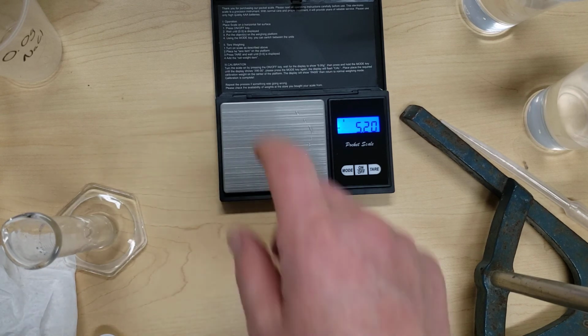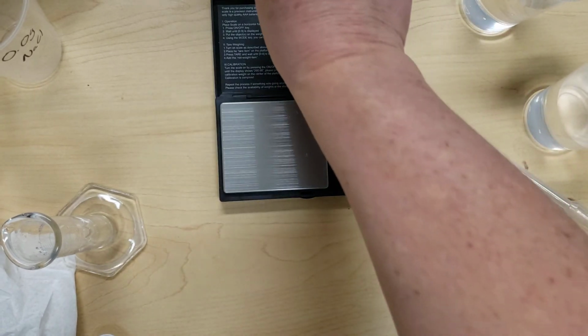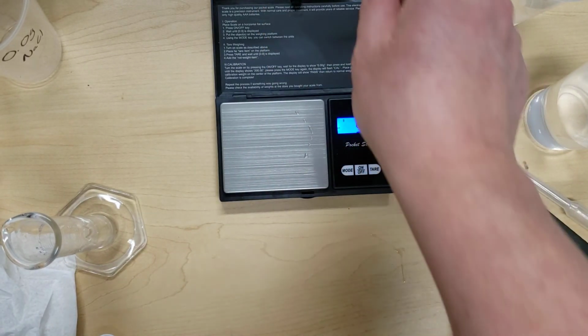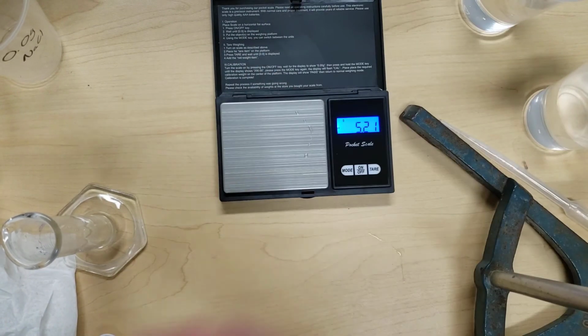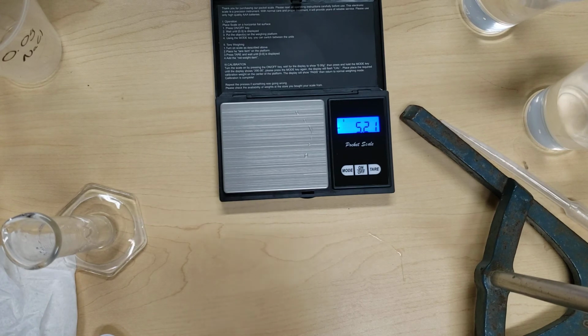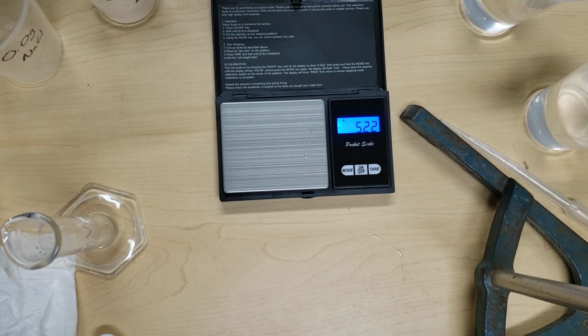Then we're going to do the exact same thing, adding about 1.75 grams and 10 milliliters of water, then about 2.5 grams and 10 milliliters of water, making sure that each one of those solutions dissolves.